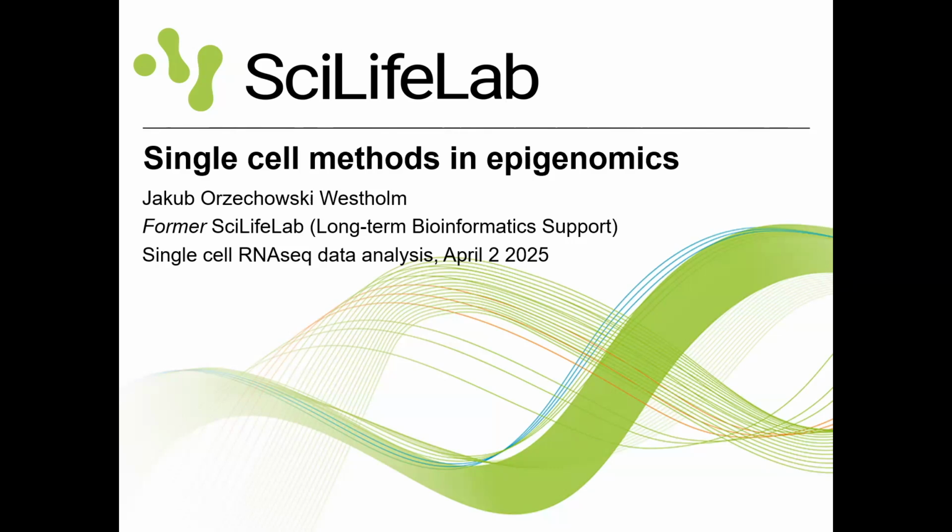Yes, so that is absolutely much gentler treatment than the bisulfite sequencing, but it's still hard to get good coverage across many sites, even with those enzymes. And also you need to sequence a lot when analyzing many cells. So far the bisulfite will be mostly adapted, or actually it should be the most commonly used, right? Instead of the enzymes.